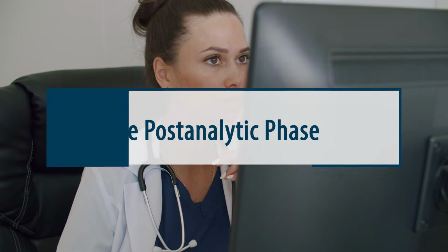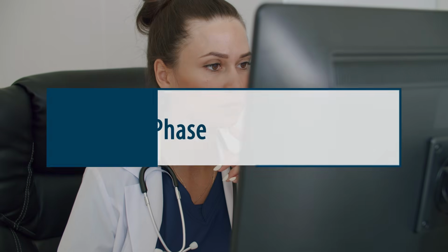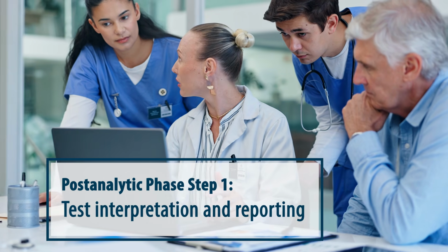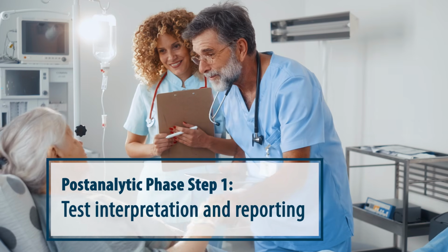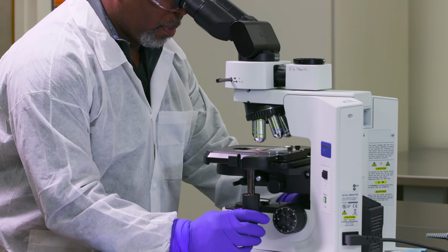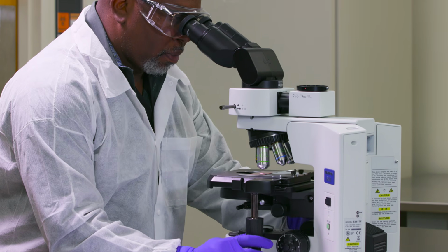The post-analytic phase is the final phase in the total testing process. During the post-analytic phase, you will interpret and report the results of the PPM procedure according to your organization's reporting requirements. Accurate testing is essential for improving patient outcomes.